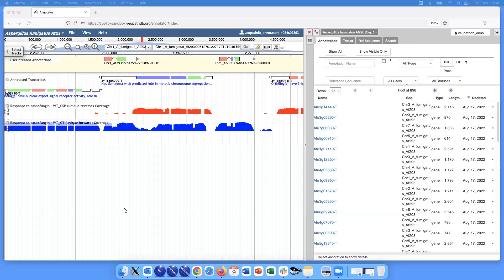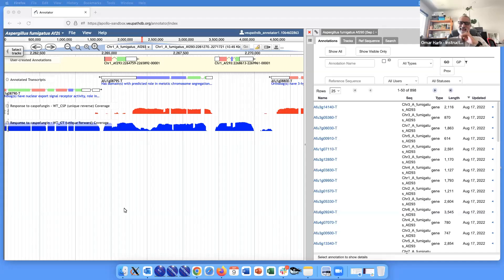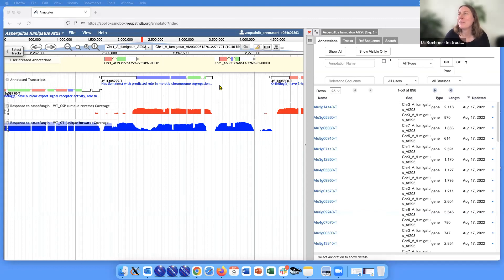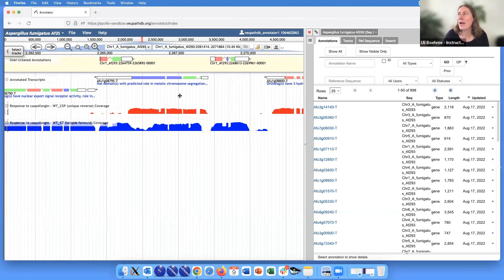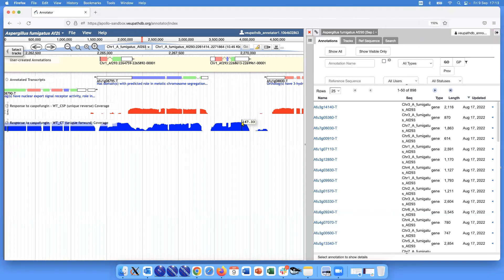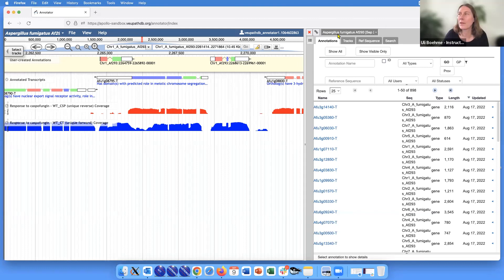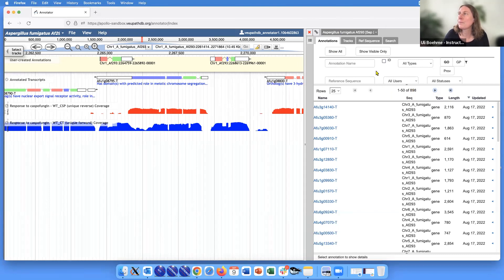Just quickly, this meeting is being recorded. Good to know. So this is very quick - just open Apollo, and I've chosen Aspergillus fumigatus, a fungal genome which also has quite a lot of annotations. If you're interested in those annotations, you can download them. I've shown you these different tabs here on top - we've covered a lot with the tracks tab.